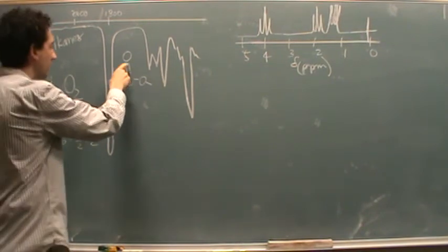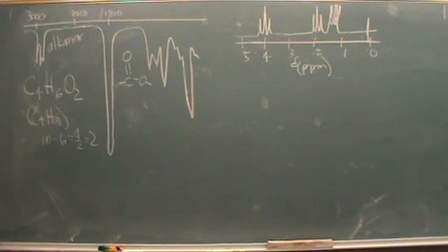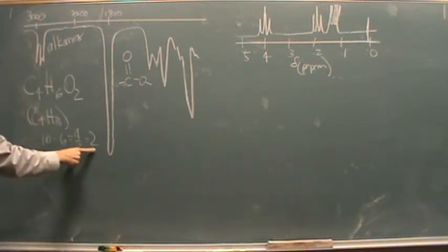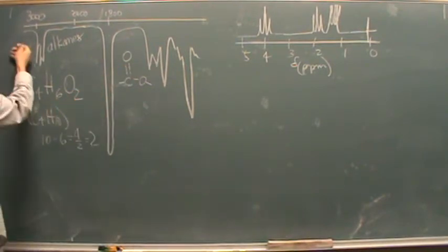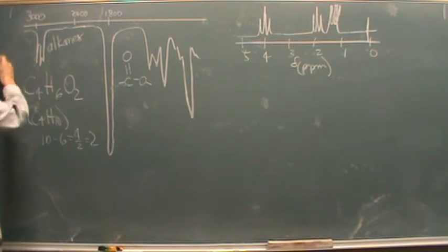One of these double bonds is coming from right here, so I either have another double bond in my structure or a ring, but I'm going to rule out the other double bonds because I don't have alkenes. So I have a ring. I have to have a ring. It's not an aromatic because I know I don't have other double bonds. I have 2 degrees of unsaturation, and so that first degree is here. The second degree can't be from another double bond because the IR doesn't show that. It has to be a ring. So I'm working with a ring here.